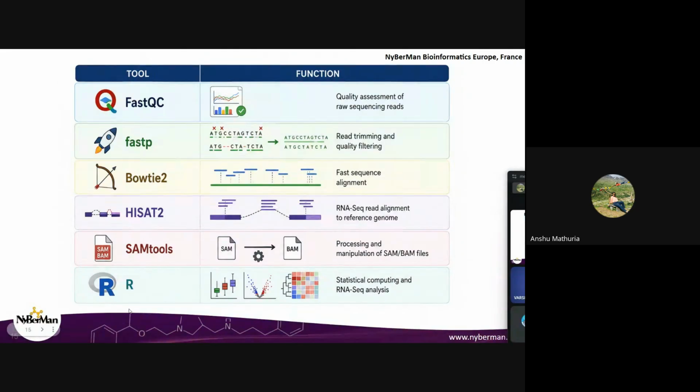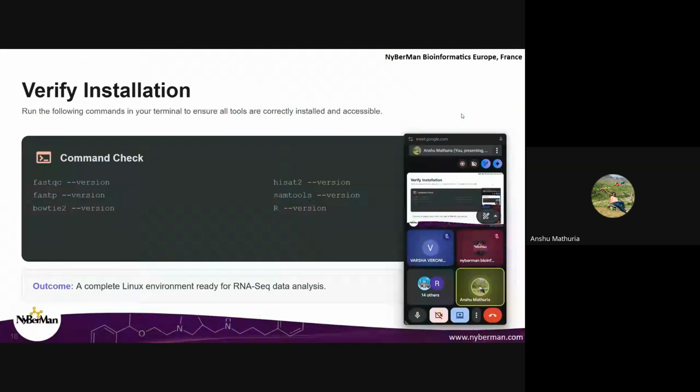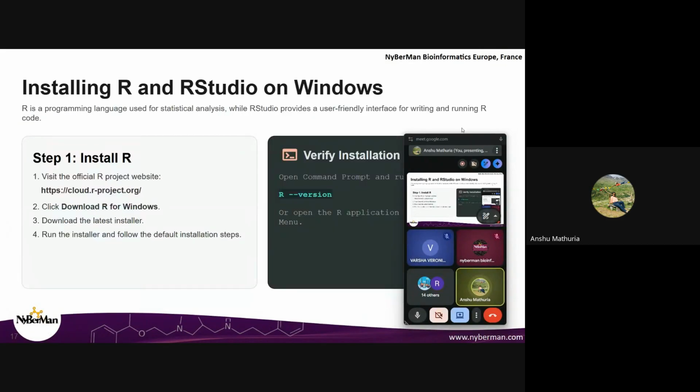All of this should be installed in your systems. This is all required when we start with a practical exposure to the RNA-seq. So all these tools will be required. Install all of this and keep your systems ready so that you can work directly. I will post a video as well, showing one or two tools getting installed, like how you write and how it is generally seen, so that it becomes easy for you to understand as well.